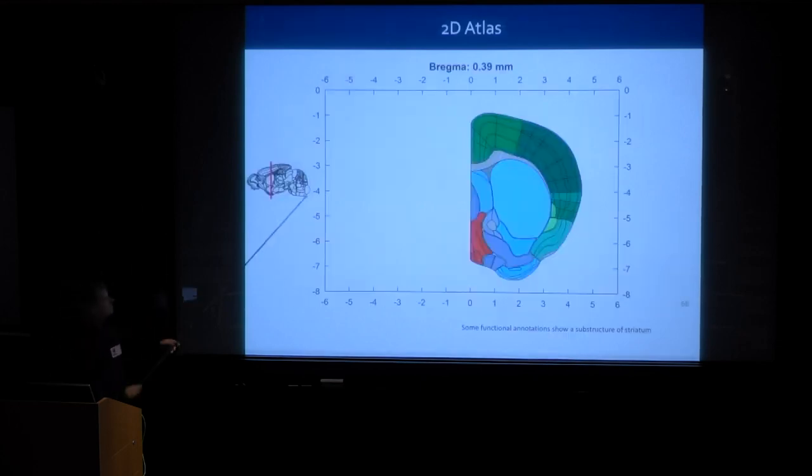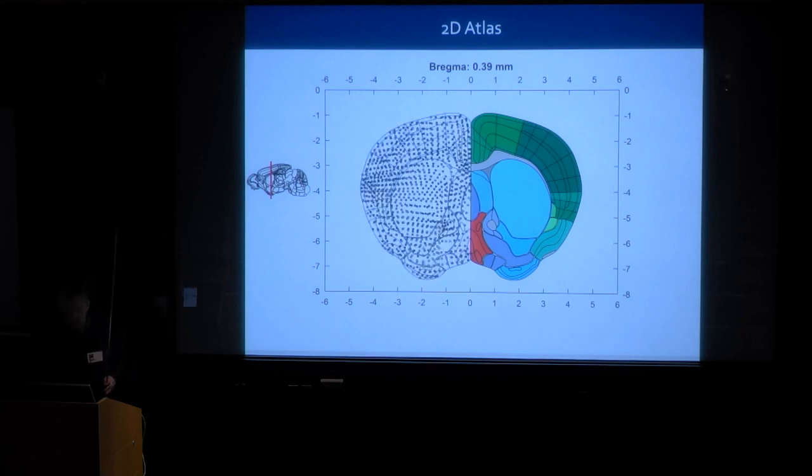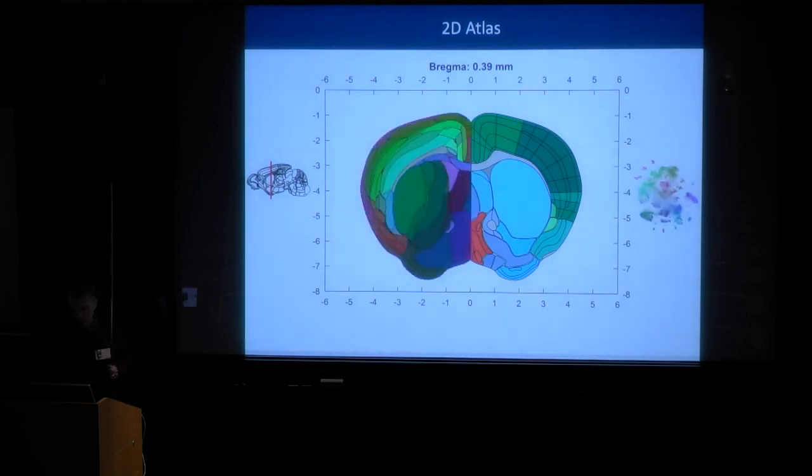So if we look at this one, which is this part of the brain, this is the Allen brain. You have structures here, but in this part, which is the striatum, you don't really have any morphology. You have no structure. So we have collected the data from this part, and it's hard to see, but we are connecting the different measurements by support vector machines to get these sheets that I just talked about. And this is the outcome from this section. You could see that this histologically, morphology non-informative region actually contains a number of new regions defined by gene expression.